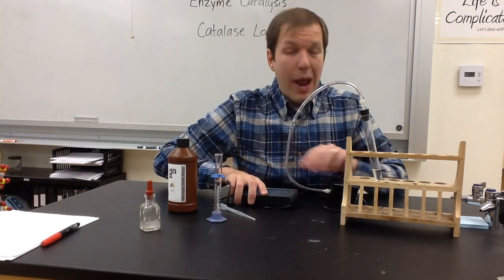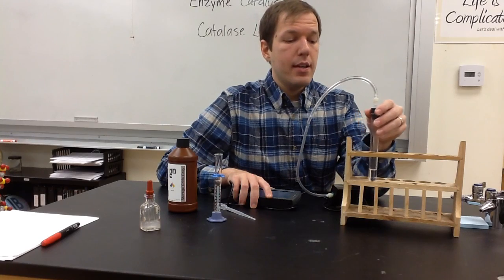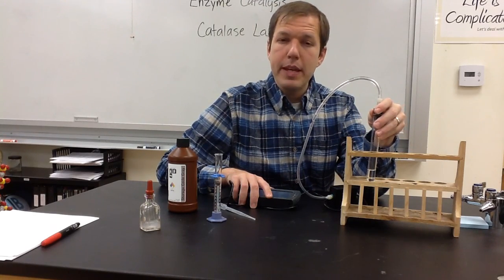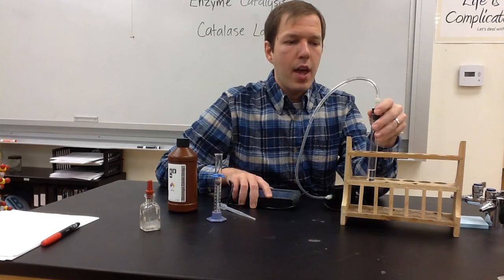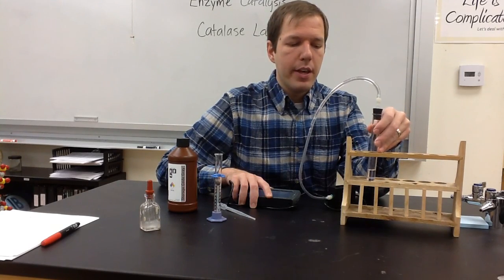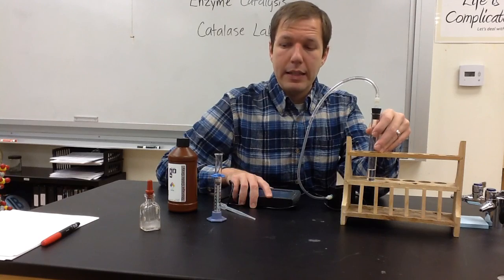We'll be practicing this, all of you using the same independent variable, but then you as a group will be choosing a new independent variable to test, and you'll be conducting your own experiment based off of that independent variable choice and producing a lab report as a result. So please pay close attention to some of the details of the procedure, because this practice is going to be really important to ensure that you do this experiment correctly.